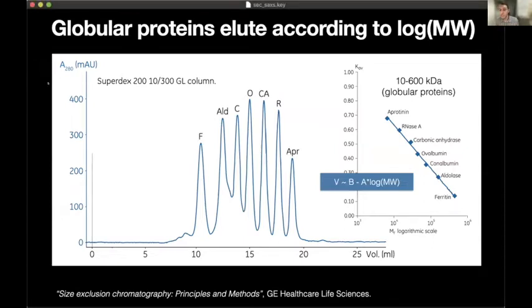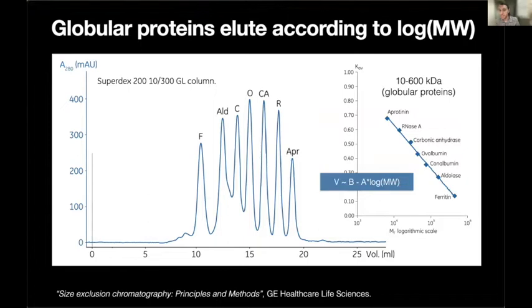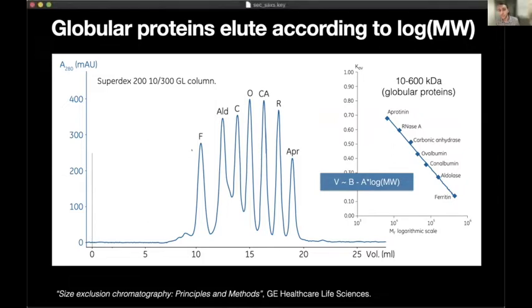One thing that's commonly done is you can make a calibration of your column. So you could buy, for example, a set of calibration standards like this set and run it through the column, and then assign each of these peaks a partition coefficient and make a plot. So this plot shows partition coefficient versus the logarithm of the known molecular weight. And for most of these size exclusion columns, they give you this kind of exponential relationship between separation, or partition coefficient, and molecular weight. So this gives you a sort of rough calibration of the column.